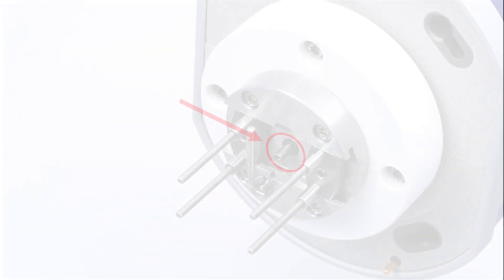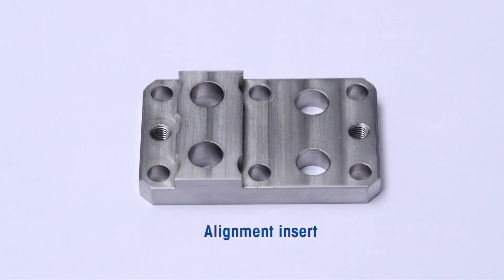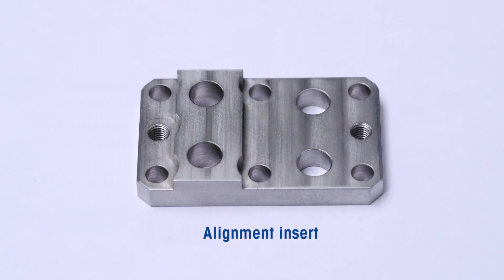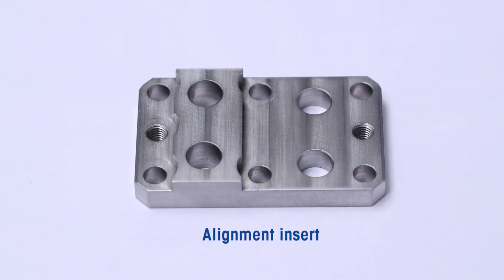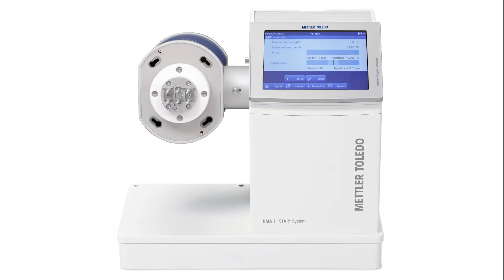Precondition: To avoid damaging the drive motor, do not exert excessive force on the drive shaft. Always install the alignment insert when fastening or loosening the drive shaft clamp. Remove samples and turn the measuring head in a horizontal position when changing the drive shaft clamp.